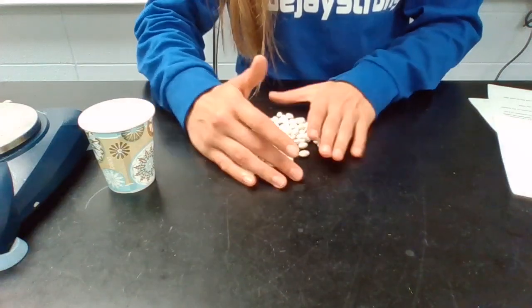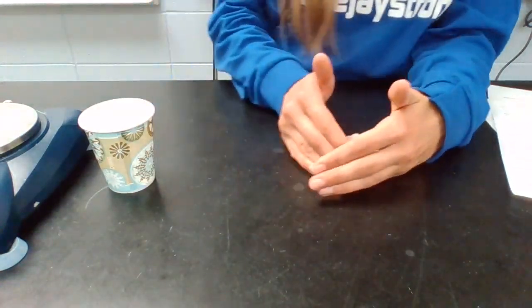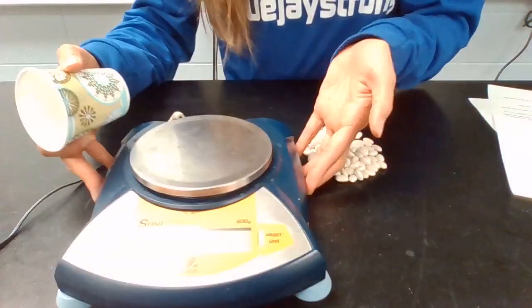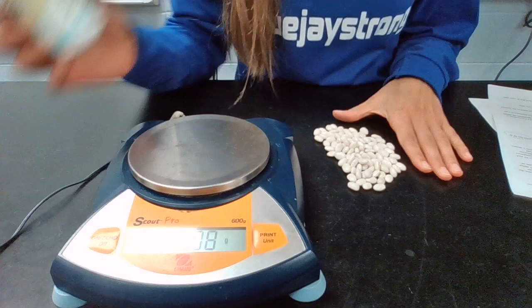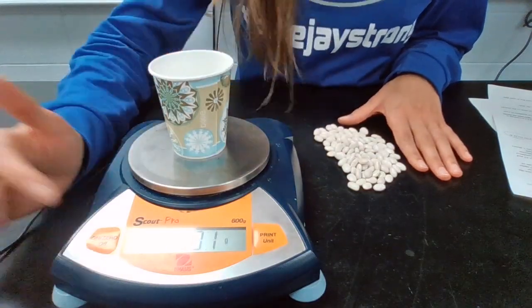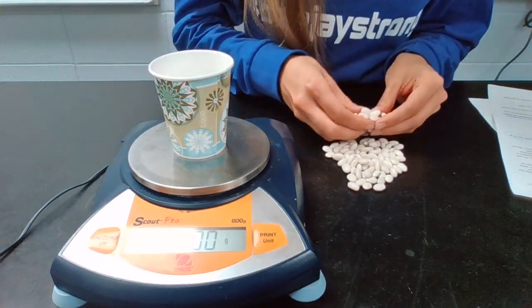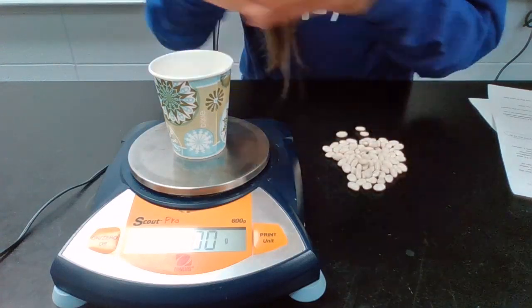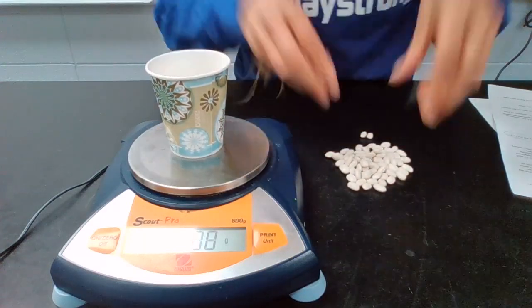96, 97, 98. I hope I counted that right. Oh well, it's close enough. All right, so now I'm going to find the mass of all of my isotope C atoms. So I'm going to put my Dixie cup on my balance. I'm going to zero this off so that the mass of the cup is not counted. And then I'm going to put all my isotope C atoms into my cup.